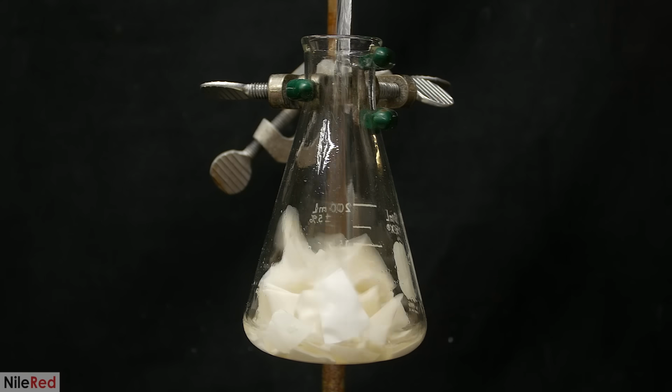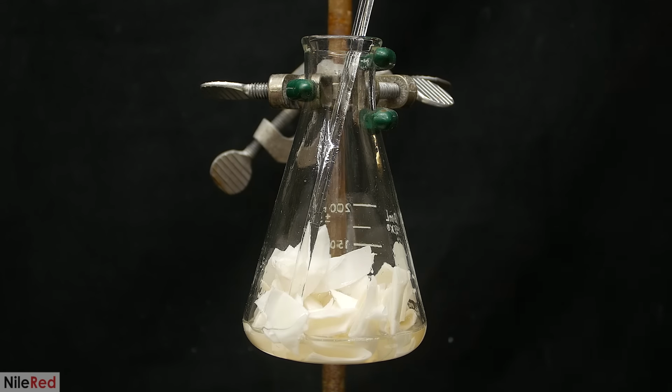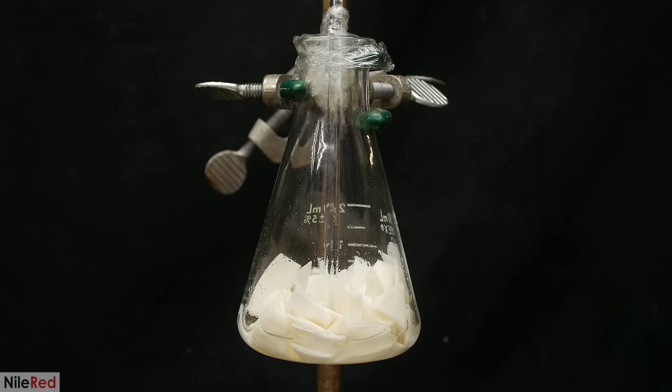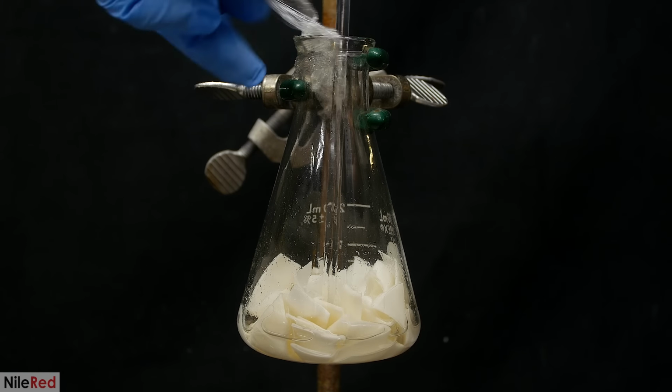What I'm doing here is a pre-treatment, and it helps open up the normally tightly packed cellulose fibers. This allows the fibers to be acetylated more evenly, and it'll also speed up the reaction. So an hour later, the pre-treatment is done, and now it's time to acetylate it.